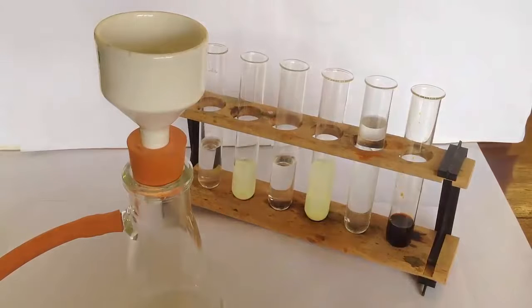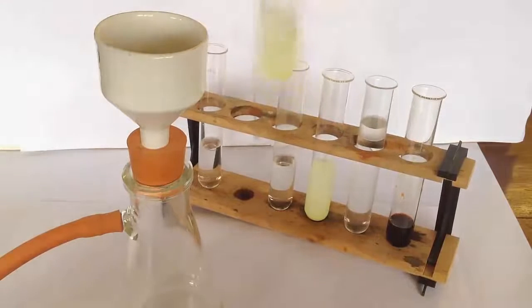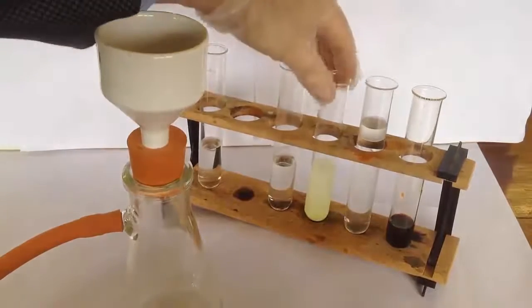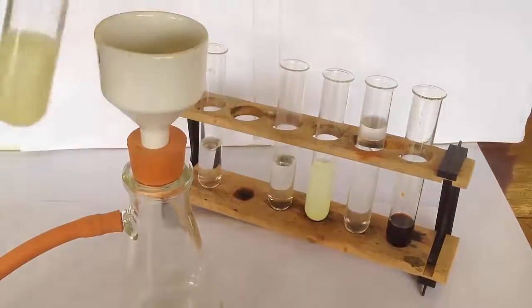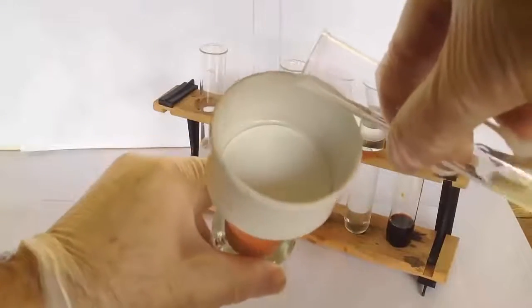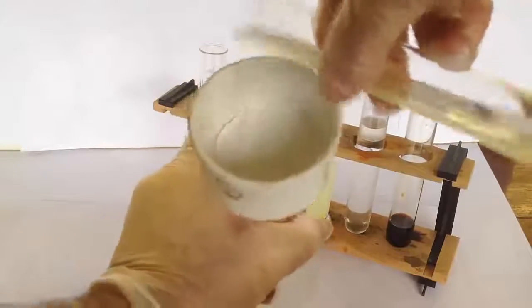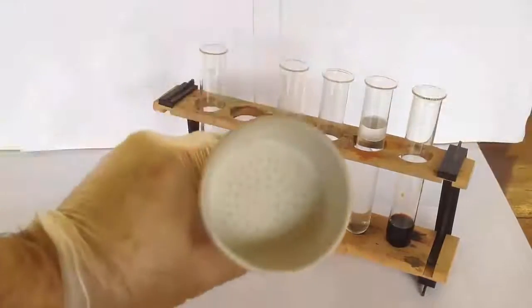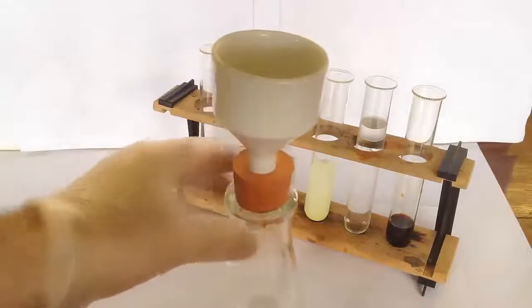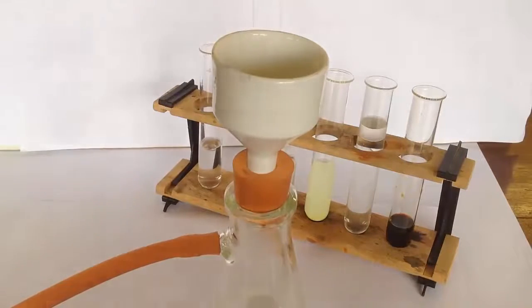Into the Buchner funnel I need to place a filter paper of an appropriate size to cover the holes. And before I pour the suspension in, I do need to wet the filter paper to make it stick down over the holes, otherwise the precipitate will go underneath, and I don't want that. So it's wetted down now with the solvent, and we can now pour it in.